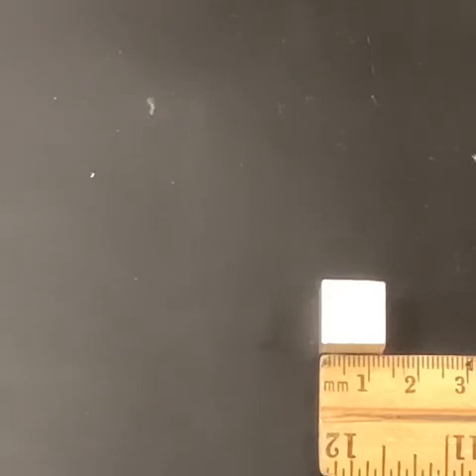So why don't you guys go ahead and take a look at what we have on this ruler. Remember that when we take our measurements, we measure to the fullest extent of the measurement. When we're doing our density calculations, we should be using significant figures in everything we do. So let's make sure that we're reading this as accurately and precisely as possible.